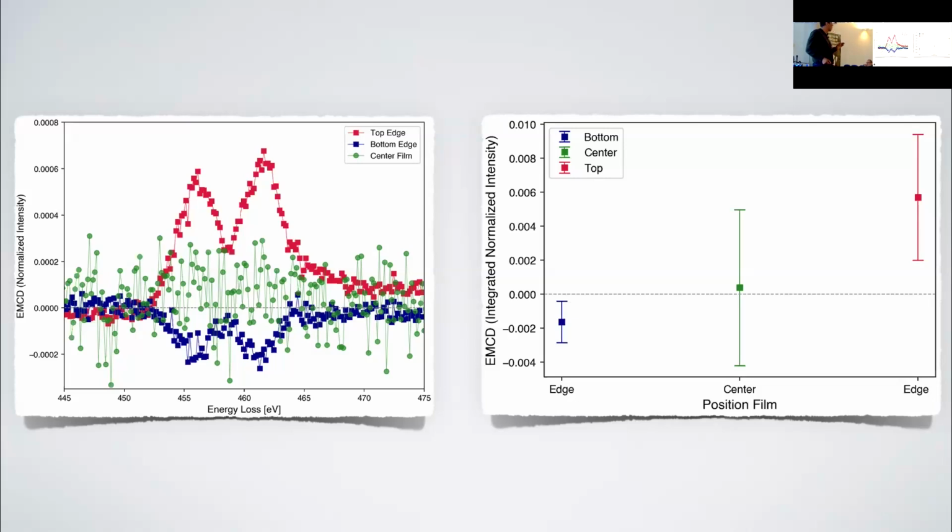Why is that? It's because the red and blue spectra were acquired with a single electron camera, while the green spectra was acquired with a CMOS detector, where the quantum efficiency is not as good. But the important thing is, when you go and you look at the statistics, you can see you have larger error bars, but it's 0, and look at the numbers of the integrated intensity.